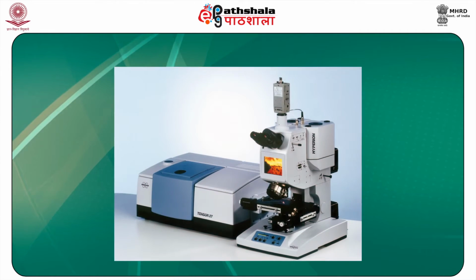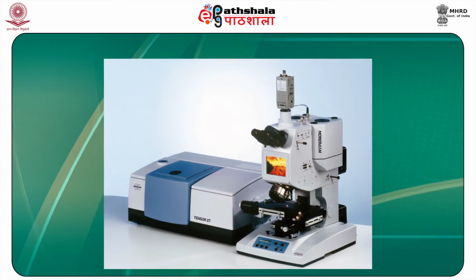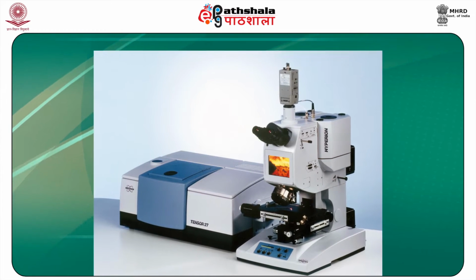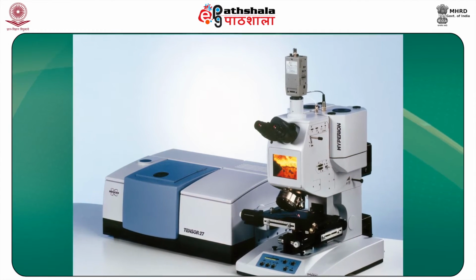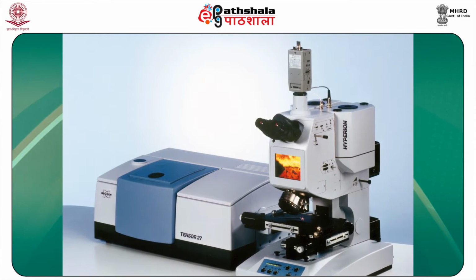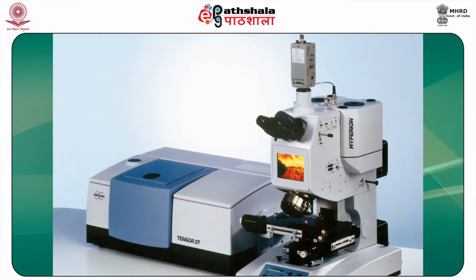It is based on the absorption and wavelength of light in a fabric polymer and it can be used in a single fiber. It is non-destructive in nature. The FTIR or the Fourier transform infrared spectroscopy is defined as a technique that is employed to obtain an IR spectrum of emission, absorption, photoconductivity or Raman scattering of solid, liquid or gaseous samples.